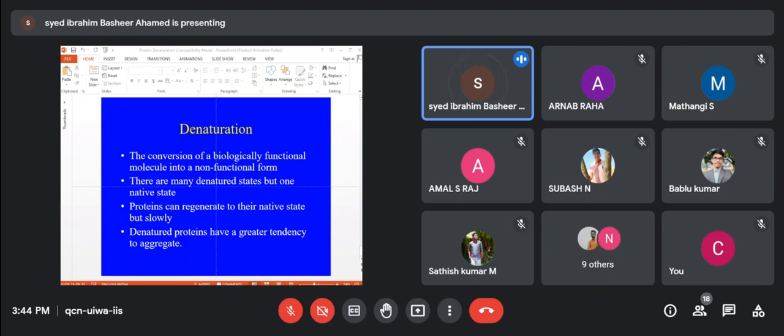So you will have an absorbance close to your native protein. But if you see the absorbance of 1 molar urea, the native population will be very small, so definitely there will be some difference in absorbance. Yes or no?